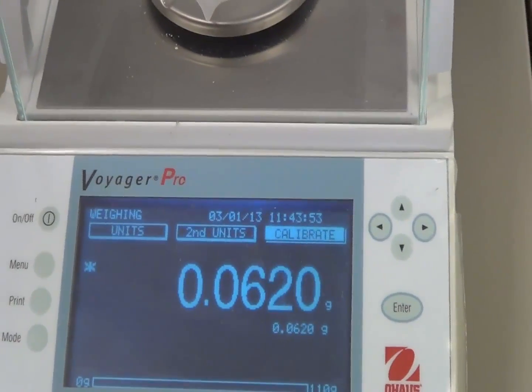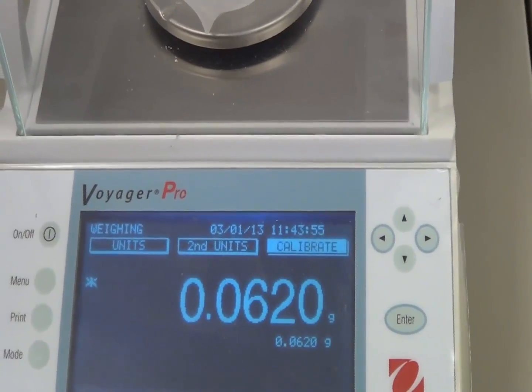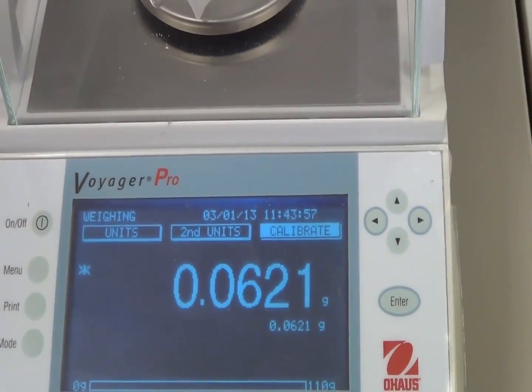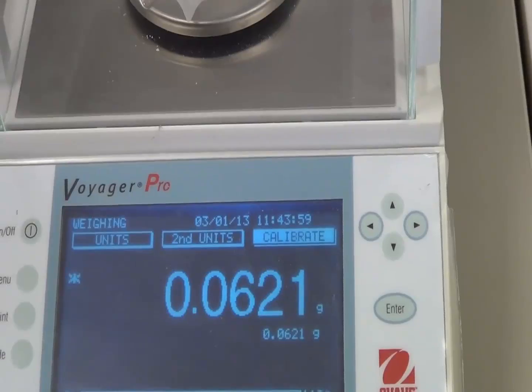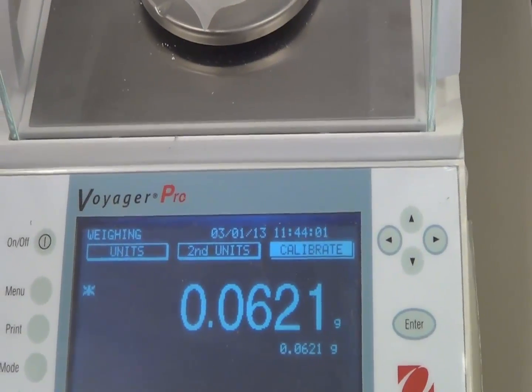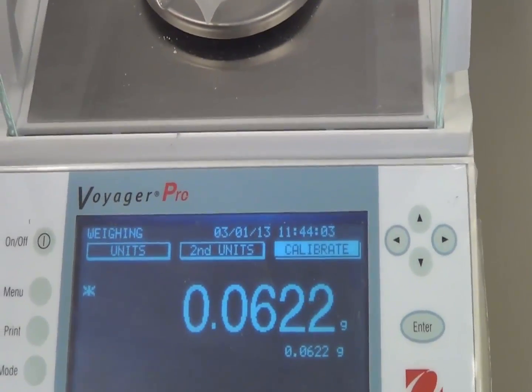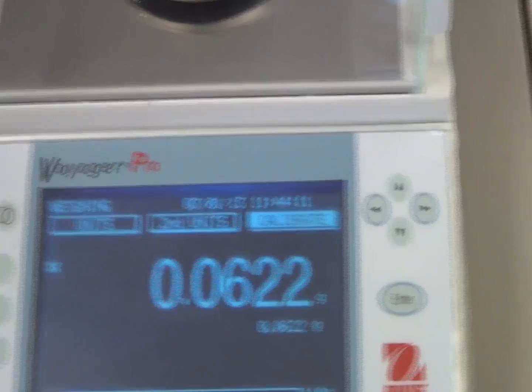0.0621. Wait a minute. Just give it like 30 seconds. So it's 0.0622. 0.0622 is the final weight.